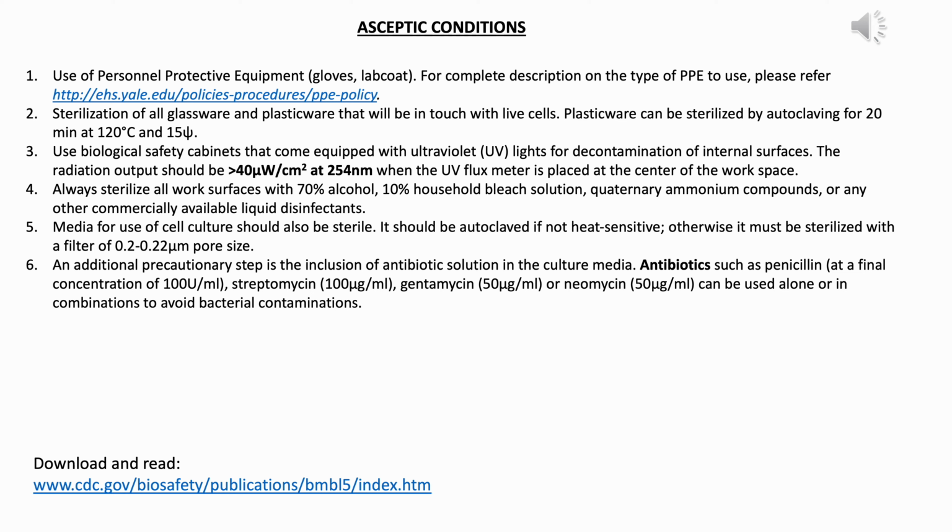So because of these various things, and of course there's a hazard for the person who is working. He can accidentally get exposed to UV if the door is open and the regulation between the door opening and UV light is not controlled. So for various reasons, people do not prefer or are not completely trusting of UV sterilization. So it is a secondary method of disinfection only. So the primary method is that the person has to be very careful in following all the other aseptic techniques. The lamps have to be periodically replaced.